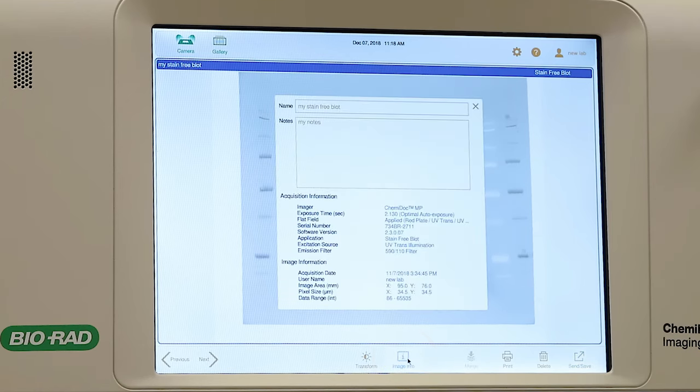If you choose the image lab file format, the custom name, notes, and all the data included below are exported to Bio-Rad's license-free image lab analysis software available for both Mac and PC.